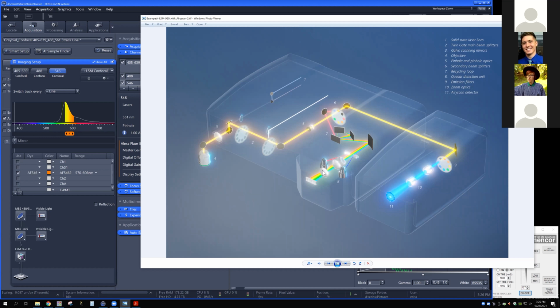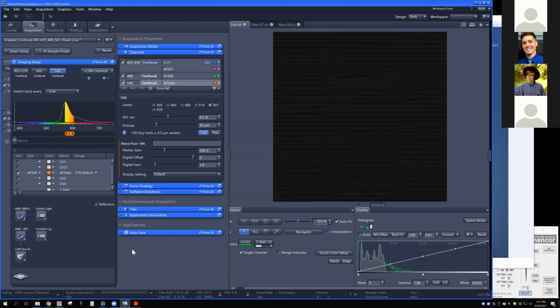Now, while we're looking at the rainbow and the pattern here, just to point out that for confocal and for spectral, we're able to set this up by splitting the rainbow and basically sending it to different places. So we're using space to capture different wavelengths. For the Airy Scan, we're using space to capture that PSF instead. And so we don't have the luxury of breaking things up spectrally as well, because we don't have 6-dimensional space to do that in. I wish we did. So for the moment, we're using these two different detectors to decide what makes it to that detector.